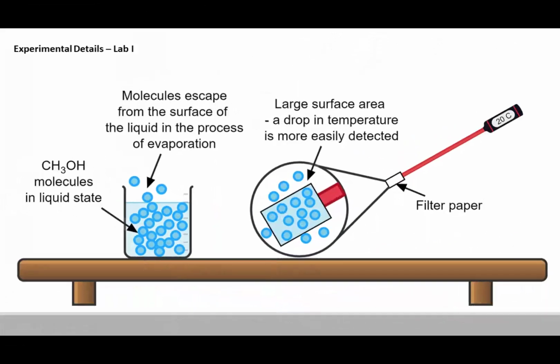In this lab, we will measure the temperature change and the magnitude of the rate of temperature change during evaporation for a series of homologous alcohols and polar organic compounds to explore the relative strengths of intermolecular forces. Recall that evaporation is essentially the phase change from liquid state to gaseous state.